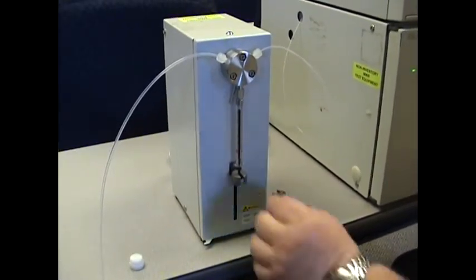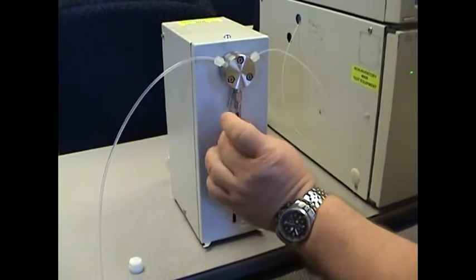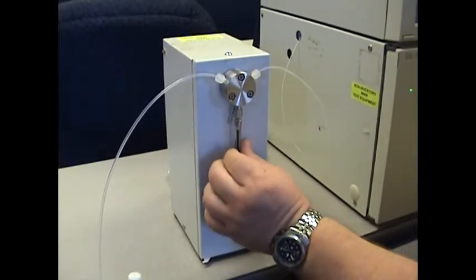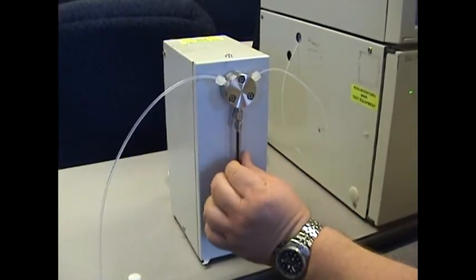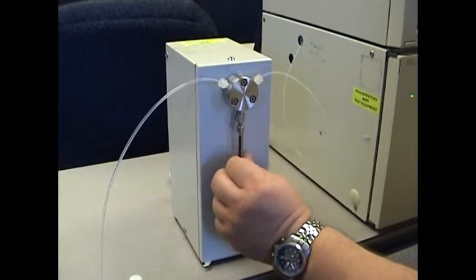You can then unscrew the body of the syringe itself. It's easier if you grip it from the metal at the top of the syringe to initially get it started. Then it should unscrew freely.